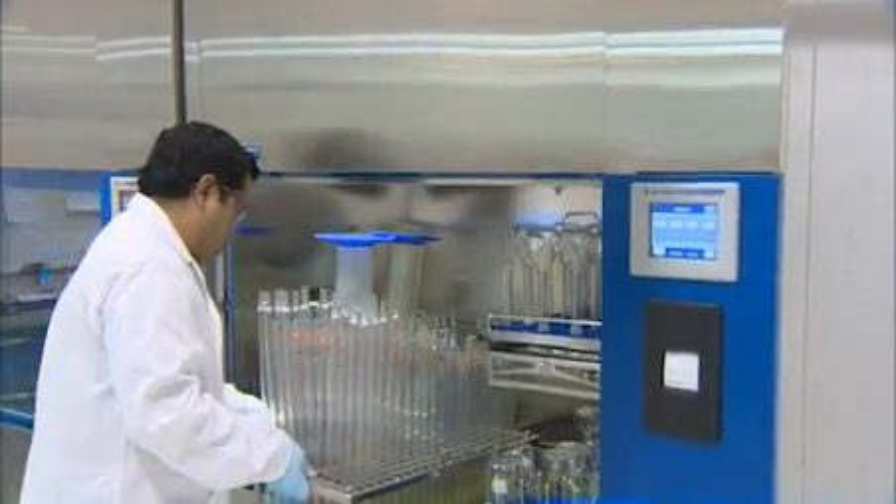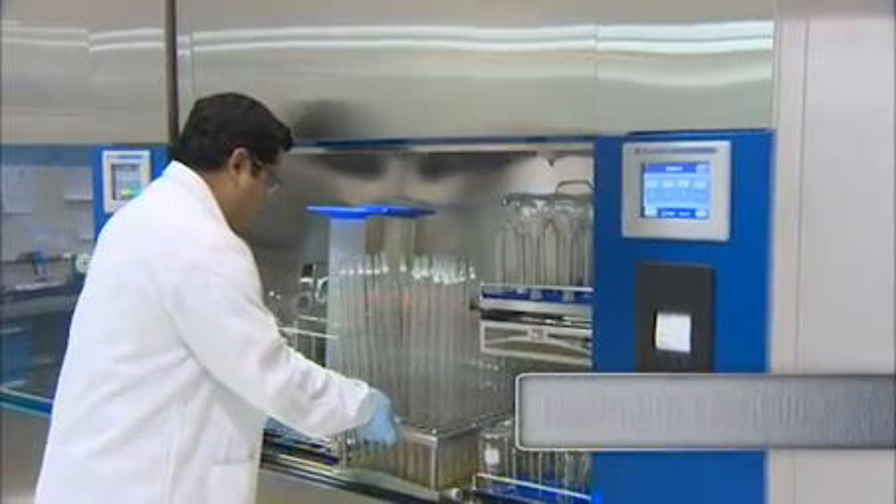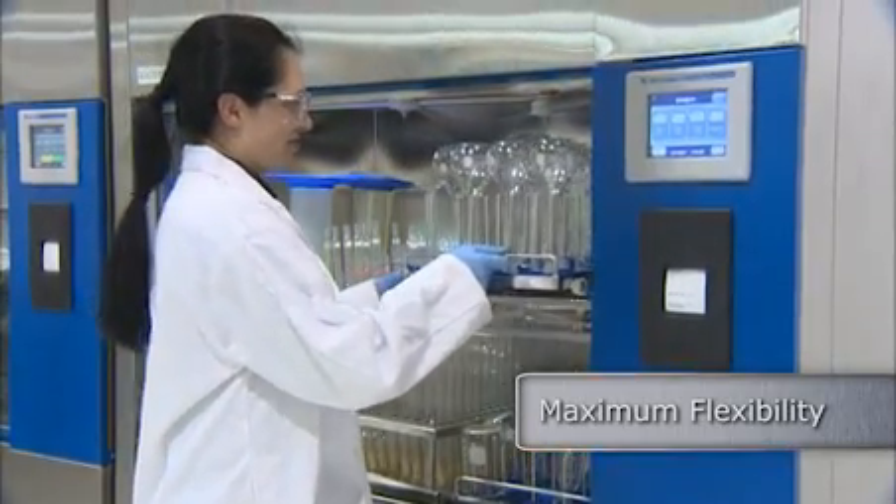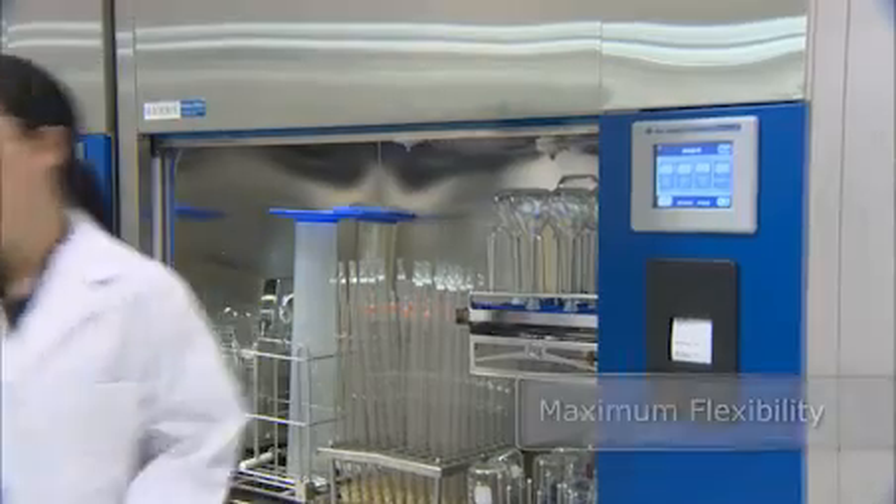The universal shelving system can easily be configured by users to process small, medium and large glassware items simultaneously while maximizing the use of the large wash chambers.